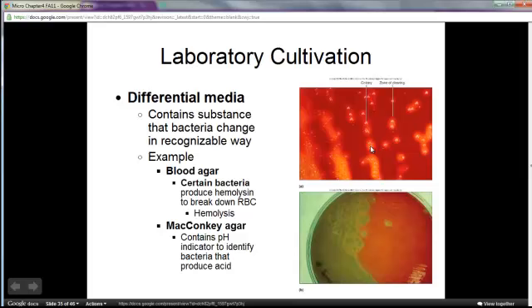You can presume that these cells can actually synthesize a protein, hemolysin, that will destroy red blood cells. Other colonies here don't have this light zone of clearing, but you see a more greenish zone of clearing. That indicates partial hemolysis of the red blood cells. And furthermore, if you see these smaller colonies right here, there's no zone of clearing at all around them whatsoever.